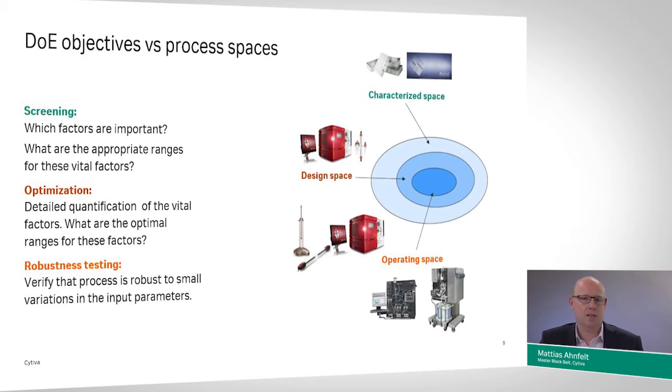So in optimization, we would typically need a rather complex DoE polynomial for the transfer function or the DoE model. So we would have a rather complex model, meaning we benefit greatly from having reduced the number of X parameters or responses that we study.